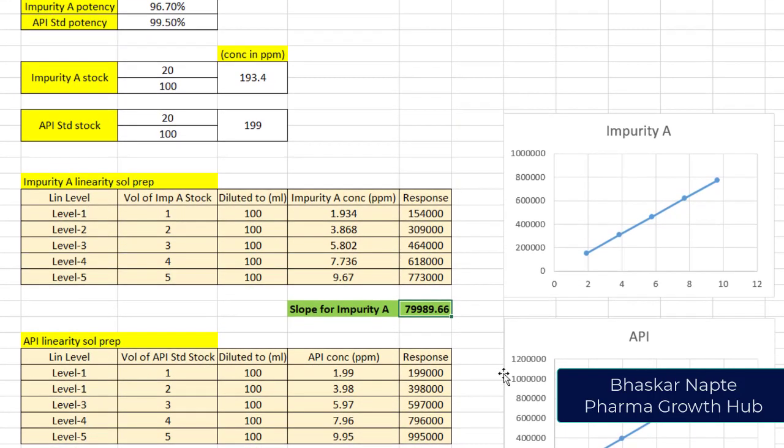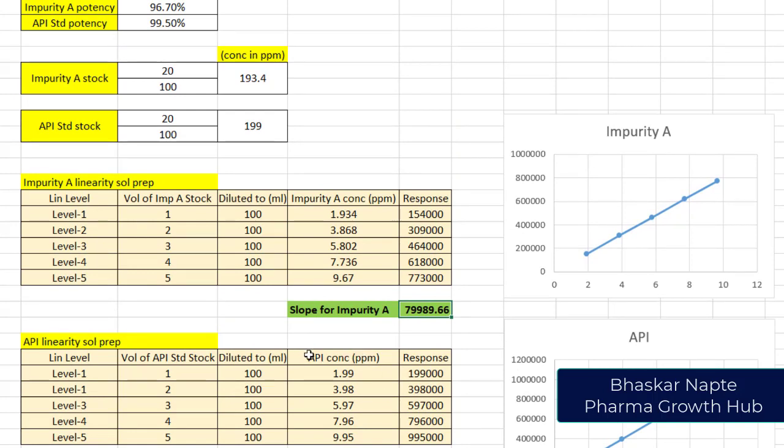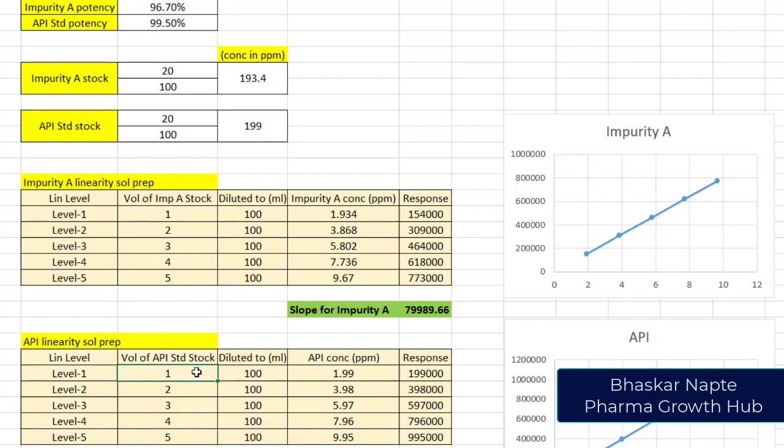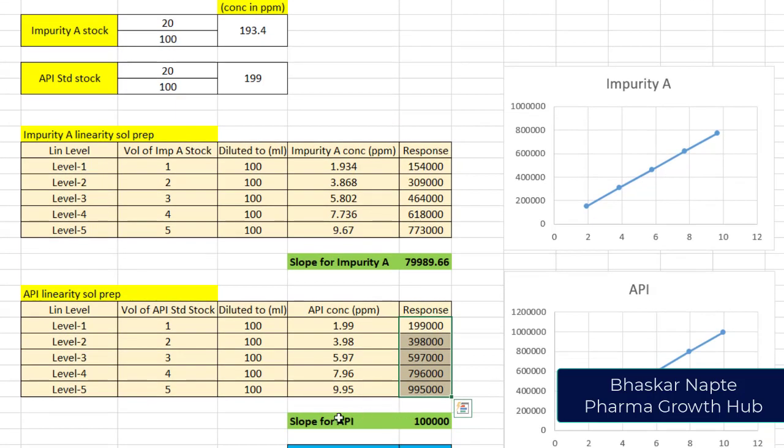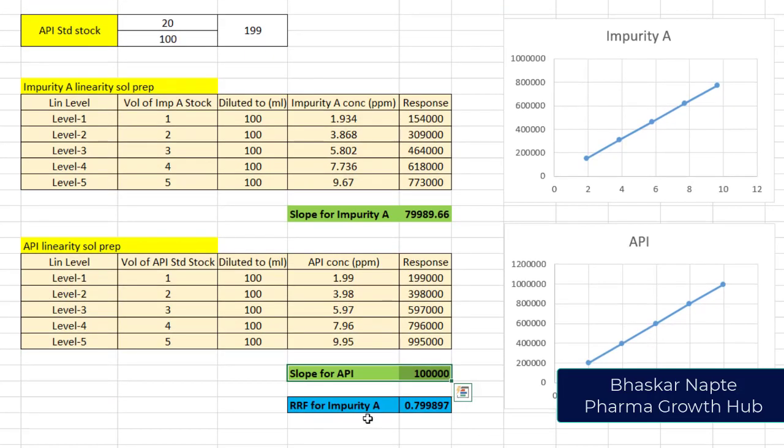Similarly, I have also prepared the linearity solutions for API standard. These are the five different linearity levels for the API standard. I withdrew 1 ml of API stock solution and diluted it to 100 ml which resulted in 1.99 ppm. I prepared the rest of the four linearity levels and injected them into the chromatographic system. These are my responses.